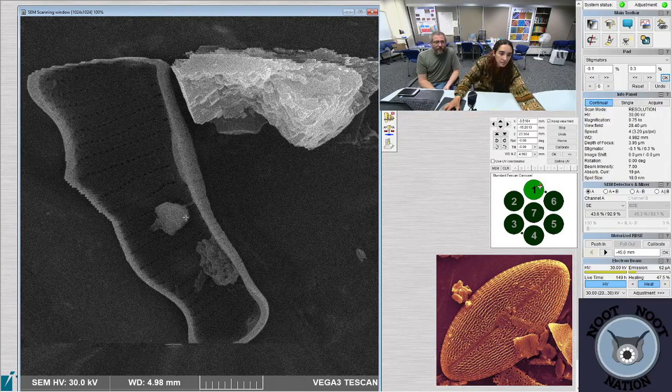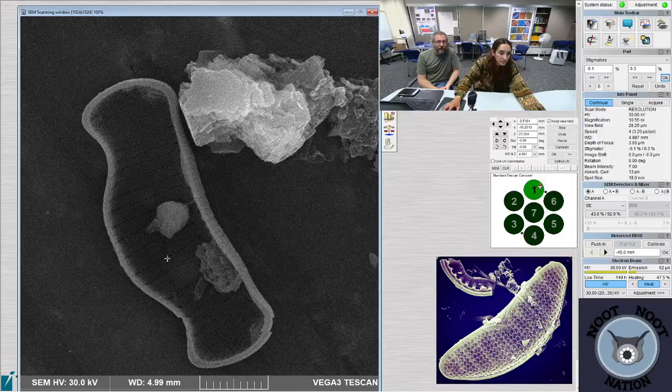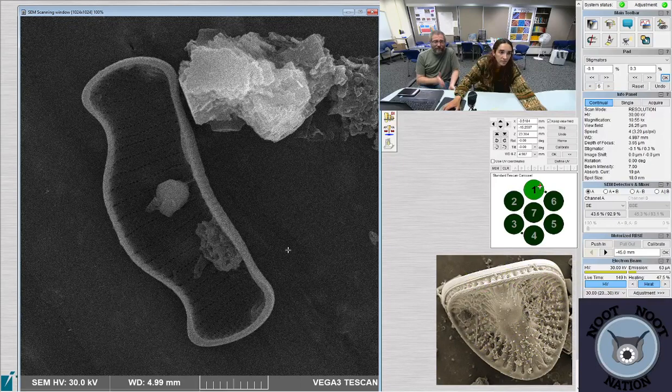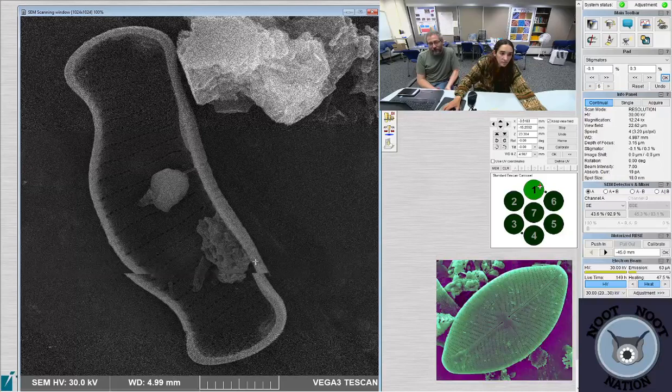The nitrogen gas, which was in the tank that I showed you, costs a little bit of money. It actually costs more money to rent the tank than it does for the nitrogen gas itself. So they just charge us for having the tank here. If it's an empty tank or a full tank, they still charge us. So there's not a lot of cost associated with the nitrogen gas, since we need to have the gas here whether we're using it or not.